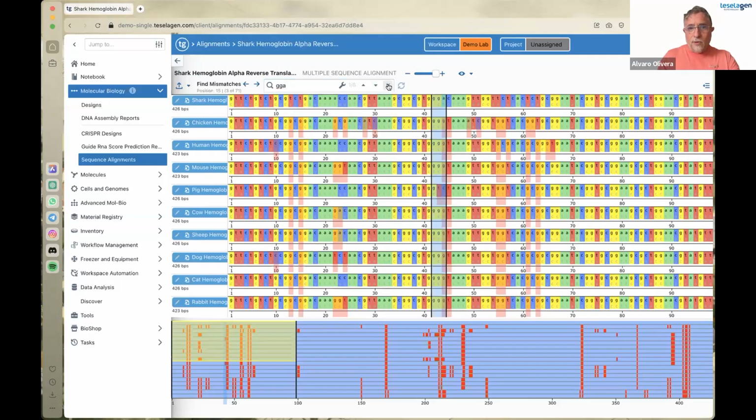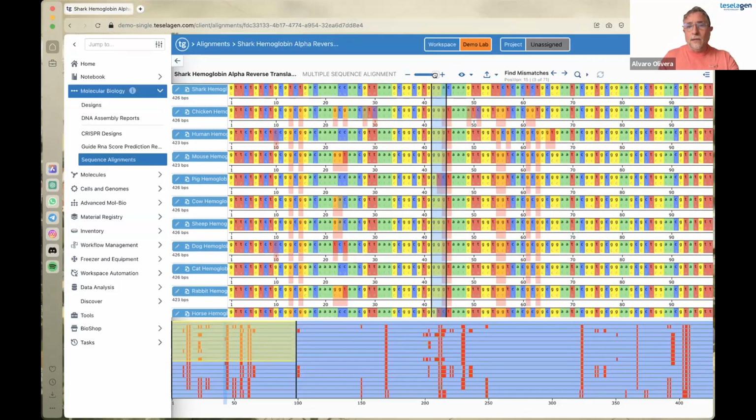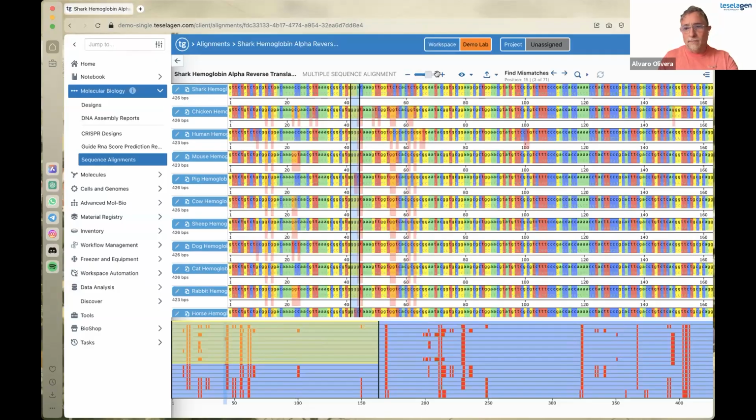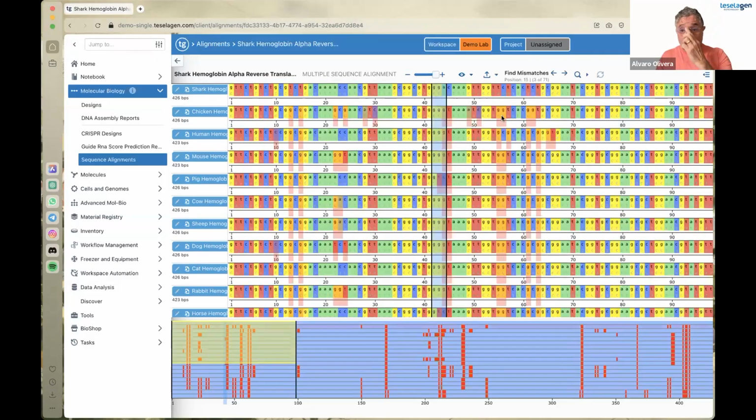This is one way of doing it. The other thing you can do is to just compress or zoom out your alignment. In this case, there is here another button that is not available. I just remember this because I will go to another example where I will use it. So this is a nucleotide alignment. You can see all of it here, and you can explore it anywhere.